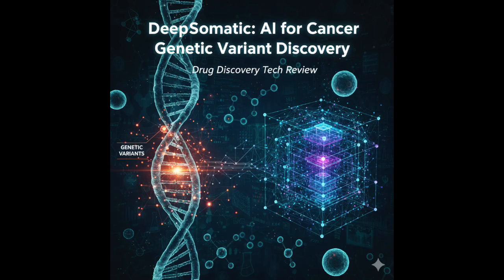Good. But look at the long-read data, like PacBio HiFi. Before DeepSomatic, the best F1 scores for PacBio indel calling were often below 50%. Less than a coin flip chance of being right. Pretty much. It was notoriously unreliable. DeepSomatic, trained on the Castle PacBio data, pushed that F1 score to over 80%. Okay, wait, from under 50% to over 80%.